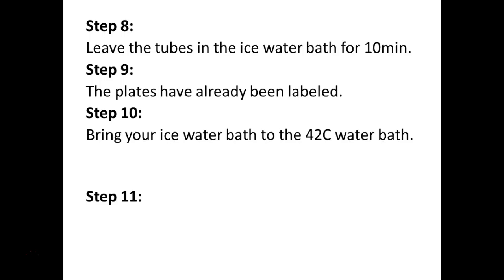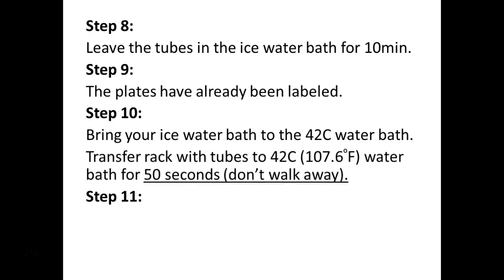You're going to bring your whole ice bath. So the little buckets I give you with the ice, you're going to carry them back there to the water bath. The reason is that once you remove the tube from the ice and put it in the water bath, when you're done, you want to quickly move it right back to the ice. So it's easier if you just bring your whole bucket with you. Timing is important for this part of the experiment.